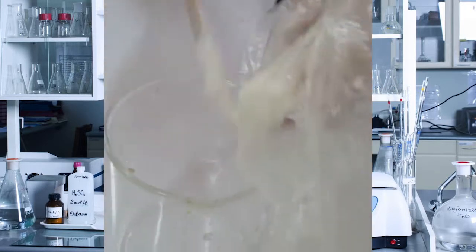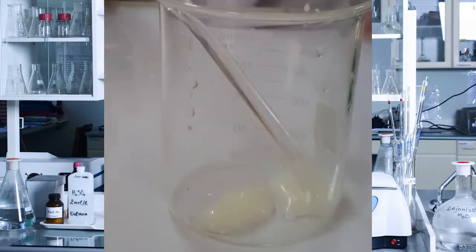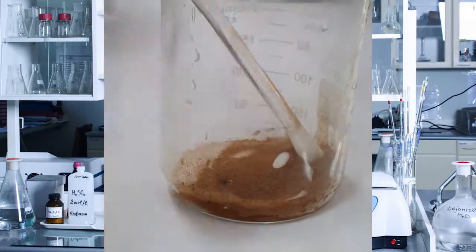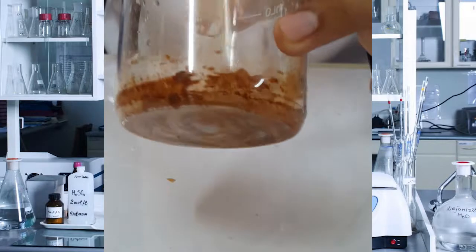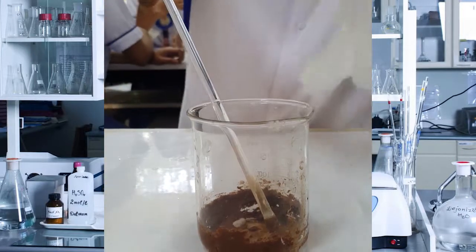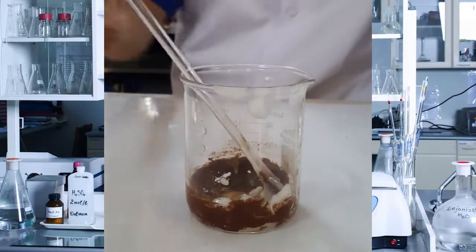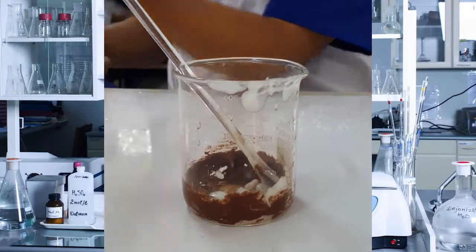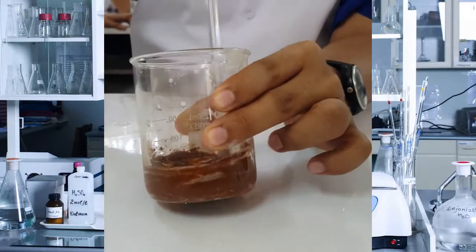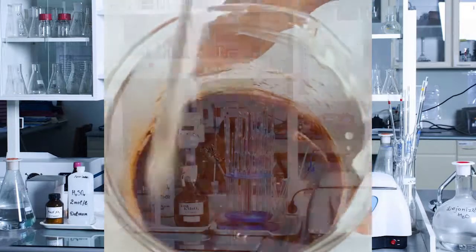We have a beaker, and our substances are mayonnaise and cinnamon. We have to mix it in the beaker, the cinnamon and the mayonnaise. So here it is. After that, stir it with your stirring rod. As you can see, the cinnamon mixed with the mayonnaise, and the particles of the cinnamon are still seen in the mayonnaise.